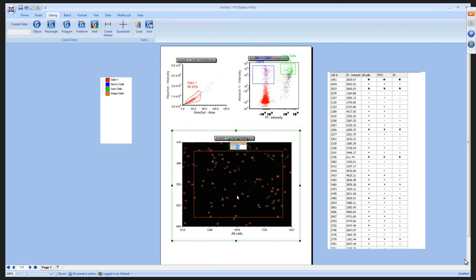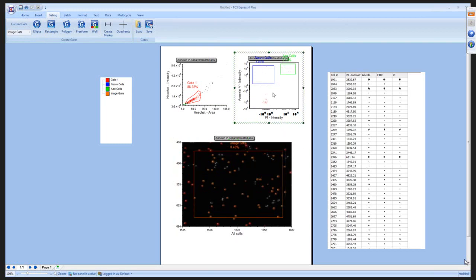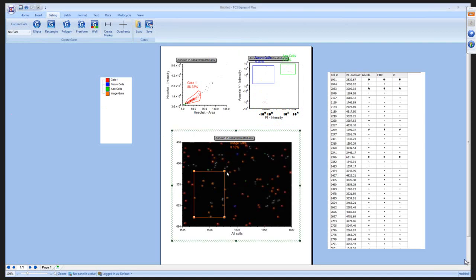And what you can see here is that it looks like most of the cells within this gate are down here. So again, what we did was we applied this gate, and we've noticed that most of the cells in this gate are live. So we're starting to get, again, spatial information from gating directly on an image, and again, we can do that directly onto our individual cells as well. And as we update these gates, you're going to notice that the statistics and these populations on the dot plots update in real time. So full interactivity between everything here.